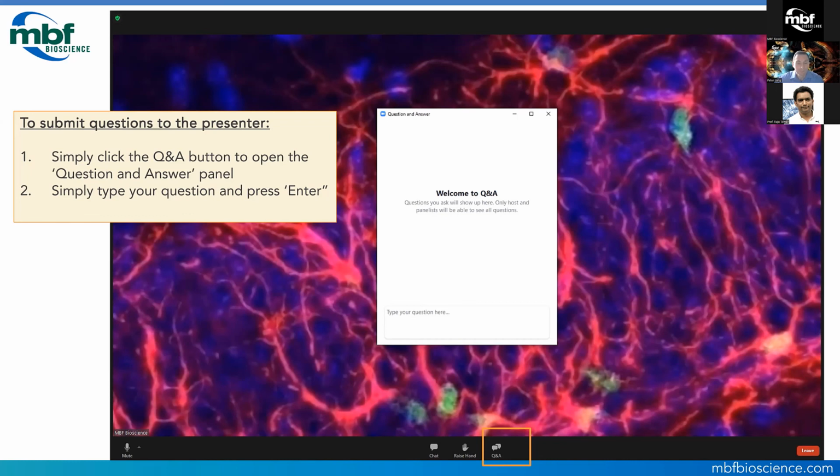But the advantage with the light sheet ClearScope is that it's independent of the clearing method used, without any need for hardware change. So that gives us the flexibility.